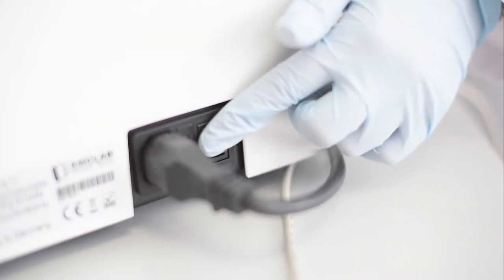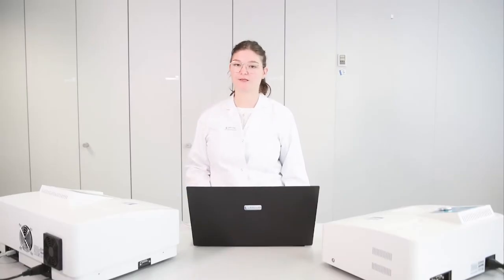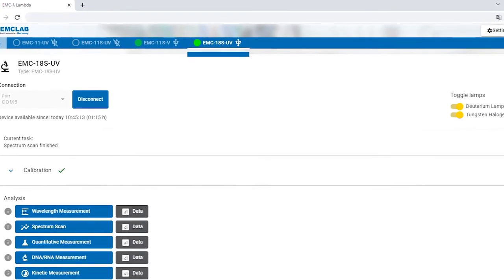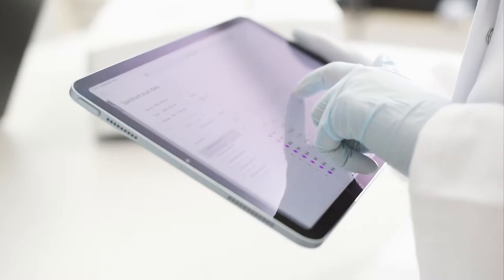After switching on the instrument you can connect it with the software and the green light indicates which instrument the software is connected to. You can use our software for both PC and tablet to check the results.